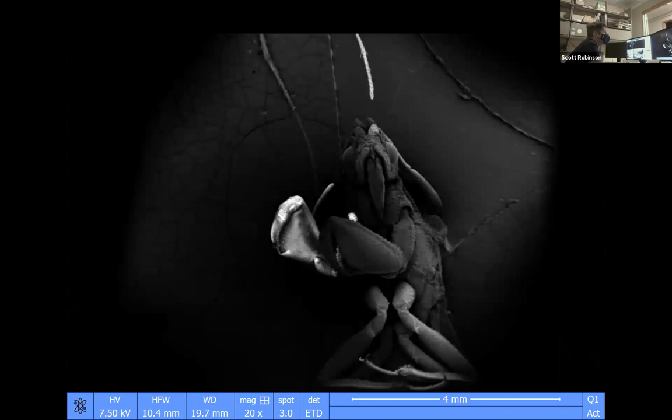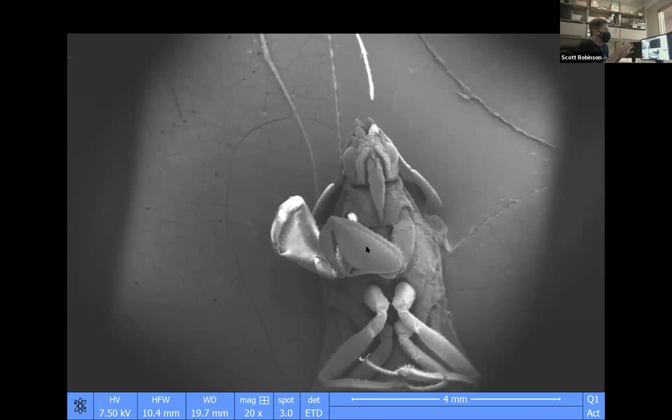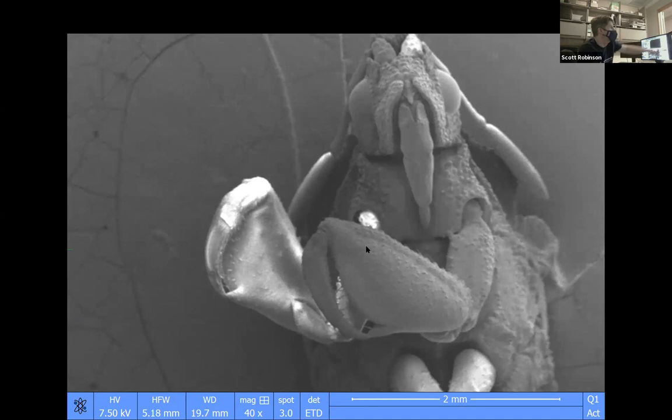Okay, so let's fix the light. It's dark and scary now. And also you can see those little arms, and the arm on the left is really, really bright. That's because the arm is loose and it's not grounded. So it's broken and the electron beam is hitting the arm and filling it full of electrons, and it's really, really bright because the electrons can't go to ground.